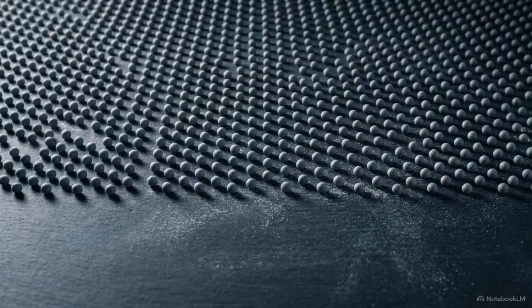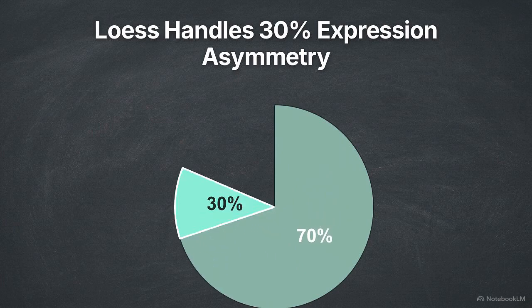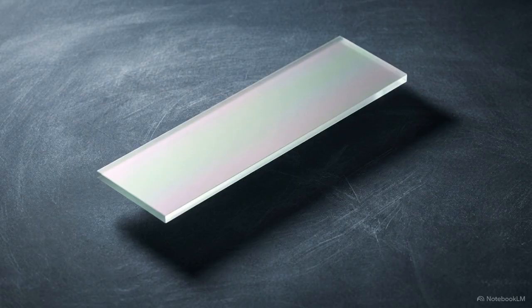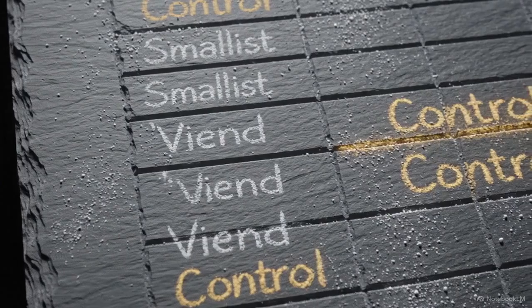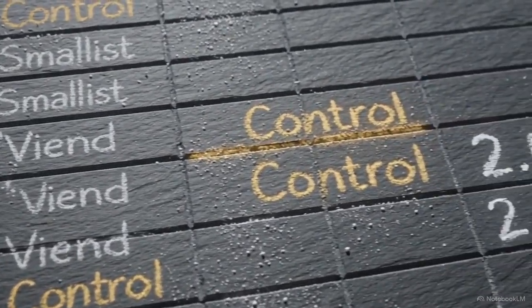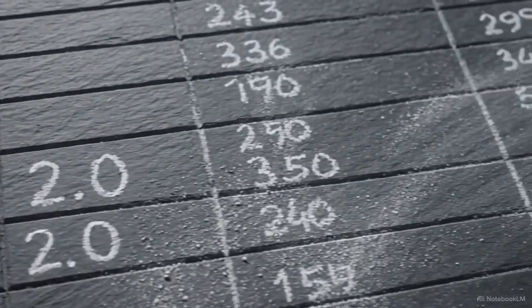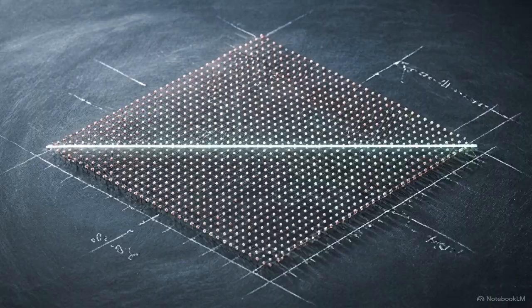This process assumes that the vast majority of probes on the array are not differentially expressed. The loess fit is robust enough to tolerate up to 30% asymmetric differential expression without losing accuracy. For platforms like Agilent that lack print tip groups, the pipeline applies global loess instead. Specialized boutique arrays with high levels of differential expression require the analyst to upweight specific, known non-differentially expressed control spots. These normalization steps force systematically biased arrays into a comparable state, completing the data preparation.